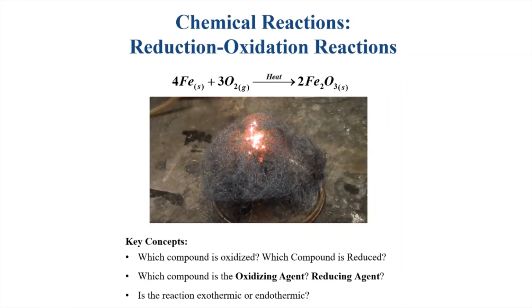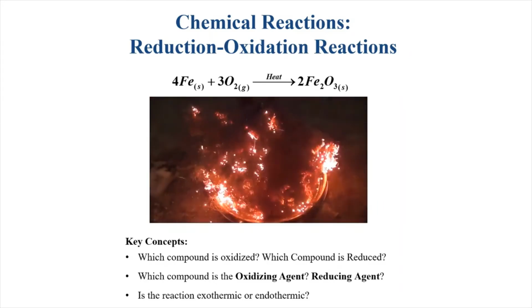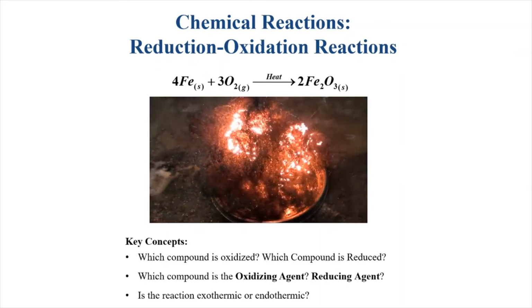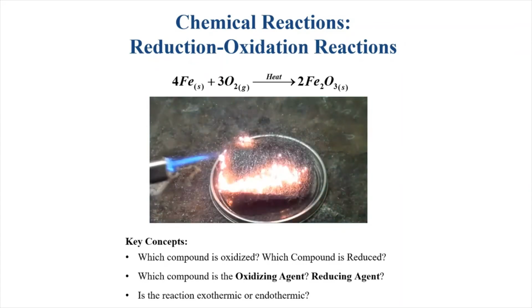This is not one that we would actually do in class, but again, I show the video because it's very interesting. And you can see that because the steel wool has a very large surface area, it's able to react very, very quickly and give this very dramatic sort of thing.